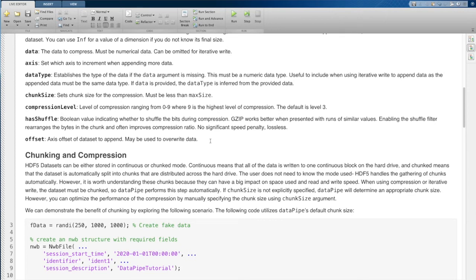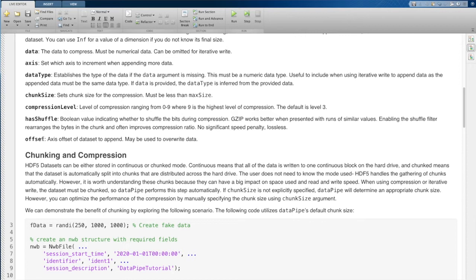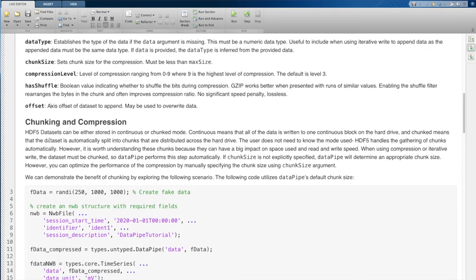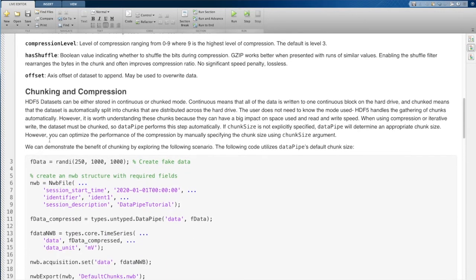Finally, we have the offset value, which sets the offset that you're using when you append to the array. So usually you can let Datapipe handle this for you. But if you want to overwrite data, then you can alter the offset value. Okay, so now that we have these arguments out of the way, I'm going to show you how to use them.